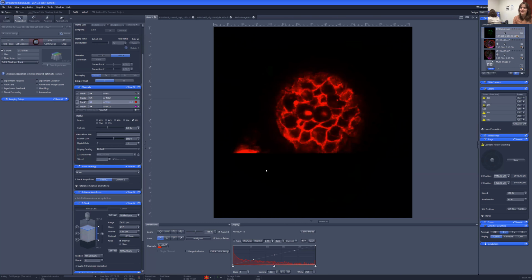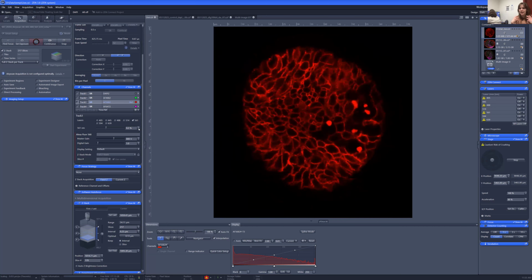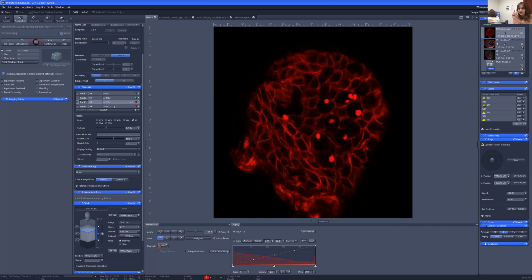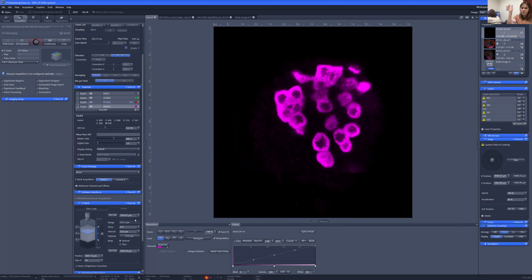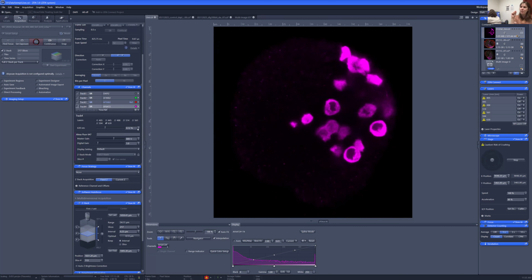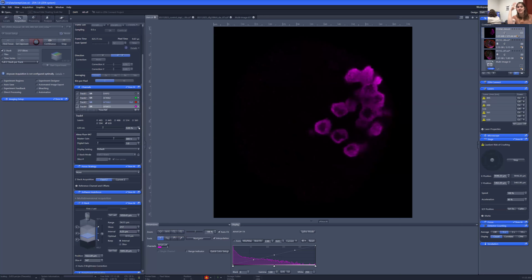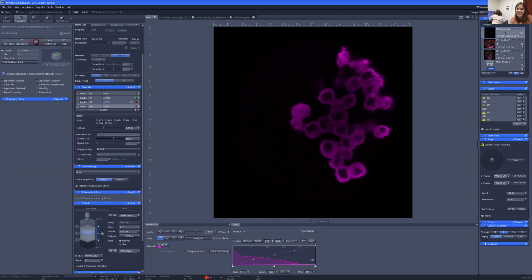The fluorescent tags, without going into too much detail, because I know I got really excited about talking about electrons in the second class, basically absorb light at a given wavelength. That light loses some energy, and then it gets re-emitted at a second wavelength, and that second wavelength is what is being detected. For example, this pink right here, the laser's being shined on at one wavelength. Anywhere where that secondary antibody with the fluorescent dye is present, that dye will convert that light into a different wavelength, and then the detector will detect that second wavelength. So wherever that secondary antibody with the fluorescent dye is located is where we're capturing the signal.